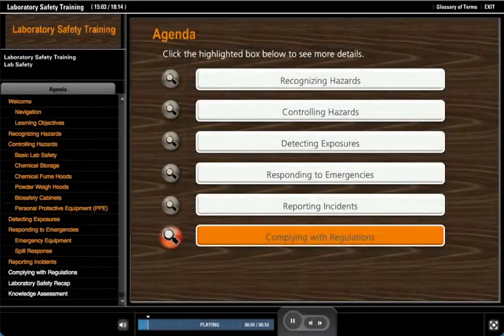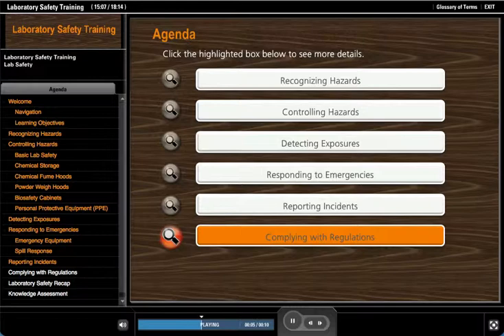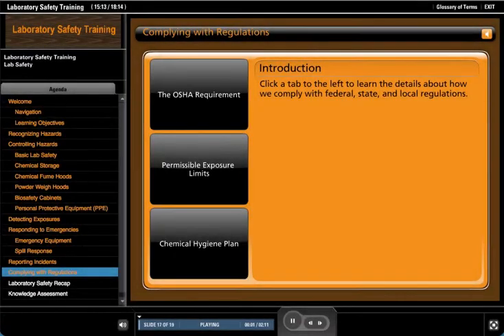The last section of this program reviews how we comply with regulations. Click the highlighted complying with regulations tab to advance. Click a tab to the left to learn the details about how we comply with federal, state, and local regulations.